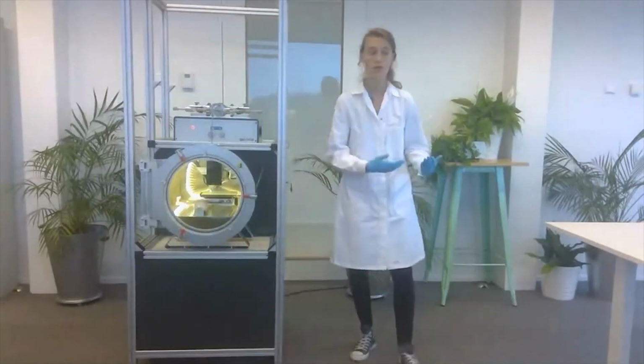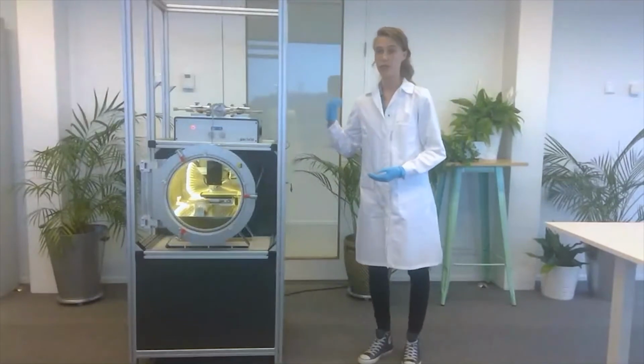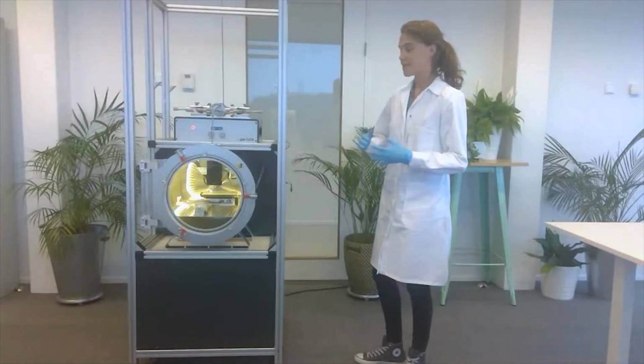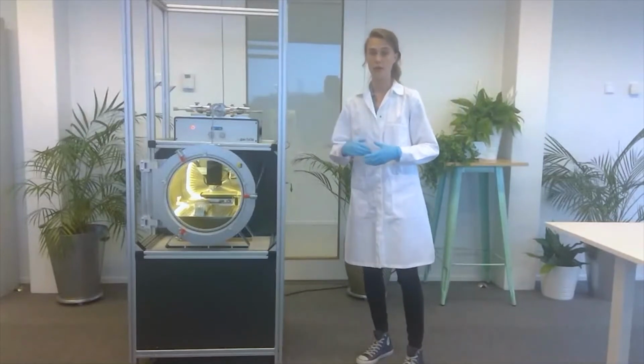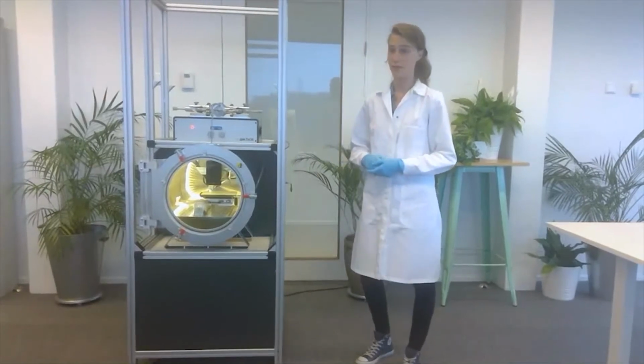With the remote control software, you can now start the pump and the spark and flow and set the settings how you want them and upload the pattern that you want to print for a substrate.